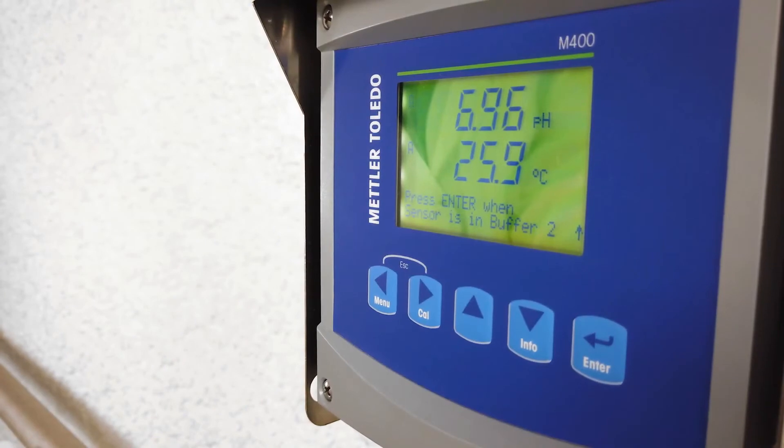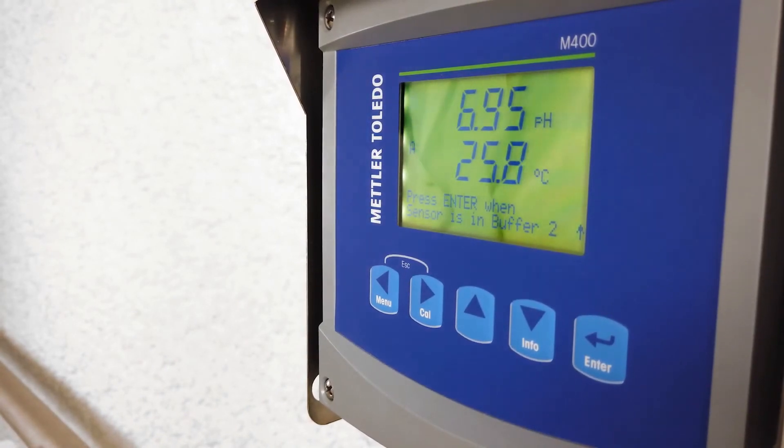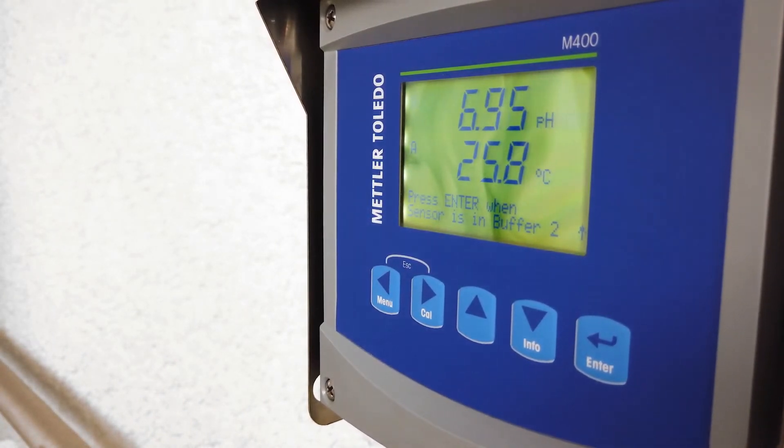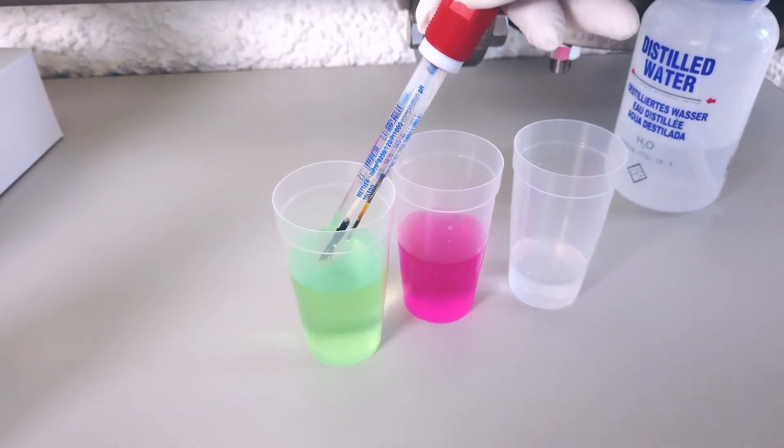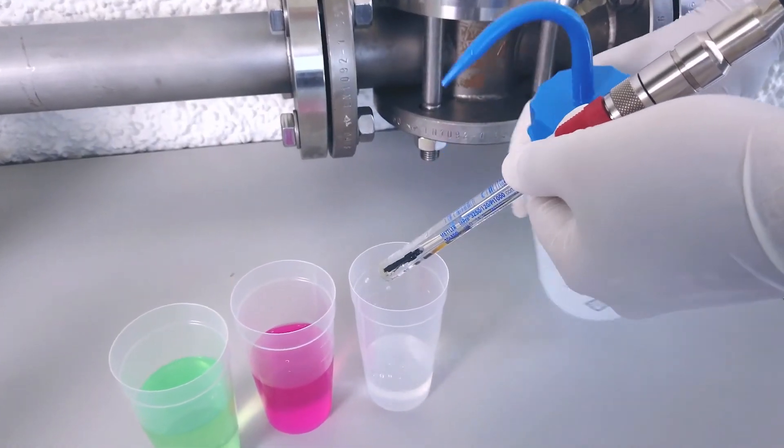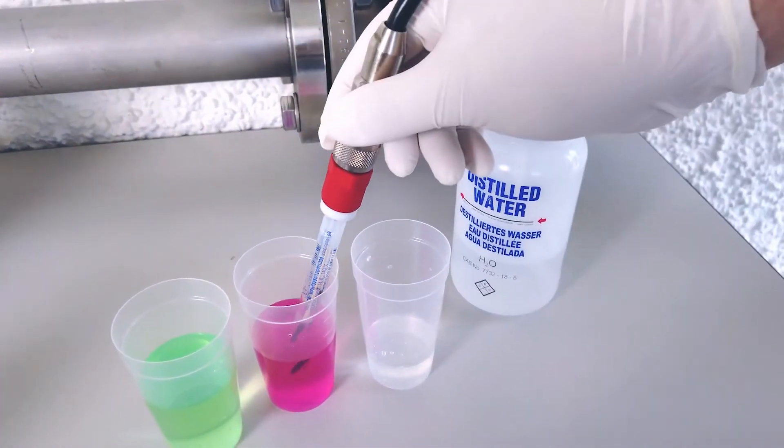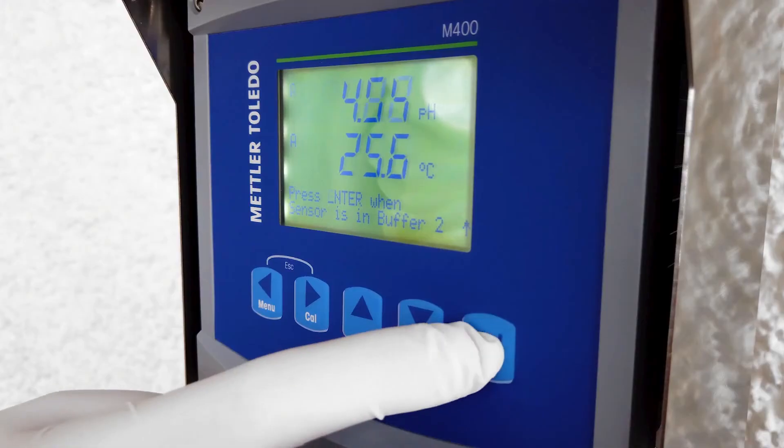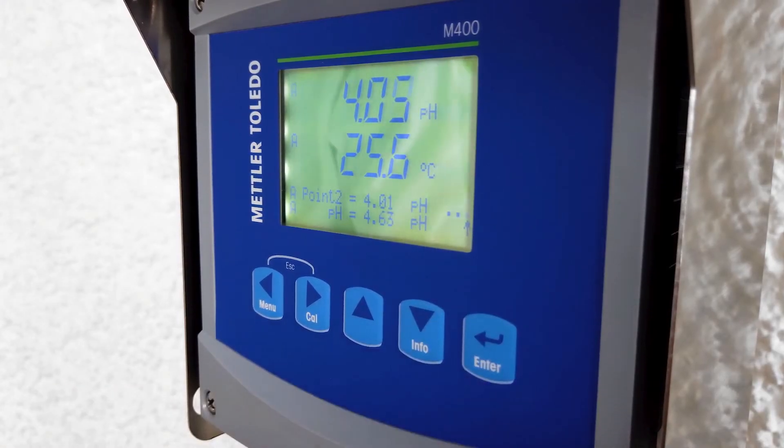Now the transmitter instructs you to put the sensor into the second buffer. In this case, it's pH 4. Remove the sensor from the first buffer, rinse it again with distilled water, pat it dry, and place it into the second buffer. Press the enter button to do the calibration.